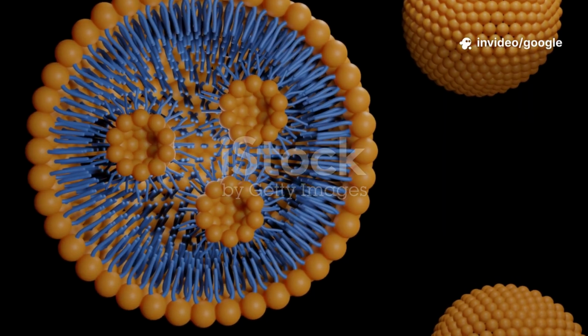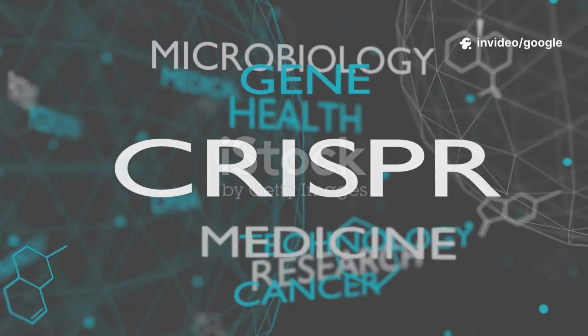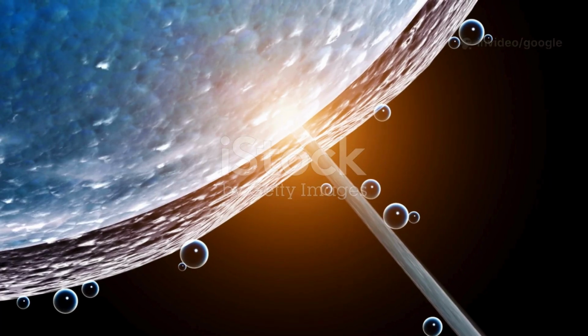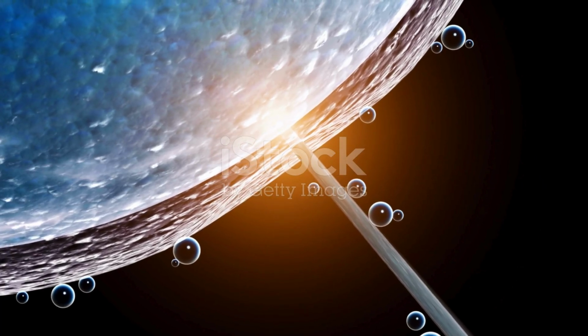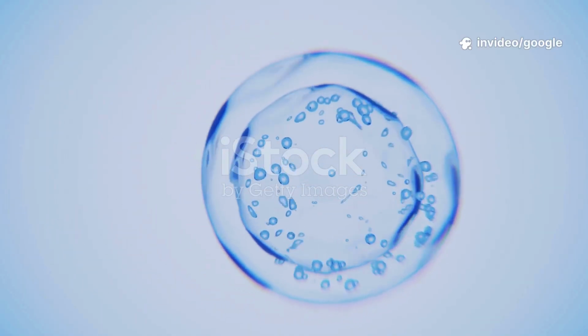Lipid-mediated transfection. The RNP complex can be complexed with lipid-based reagents that facilitate its entry into cells through endocytosis. Microinjection, directly injecting the RNP complex into individual cells, often used for zygotes or difficult-to-transfect cells.